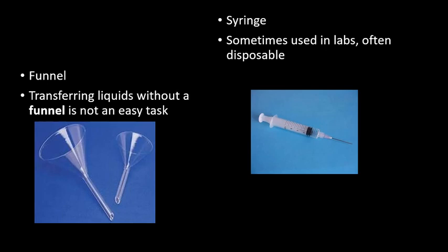Funnels: transferring liquids without a funnel is not an easy task. So always use a funnel in the lab if you feel unsure about whether you're going to spill something or not. And syringes are often used in labs to transfer liquids, so they are often very disposable.